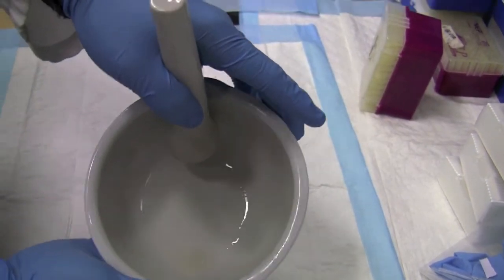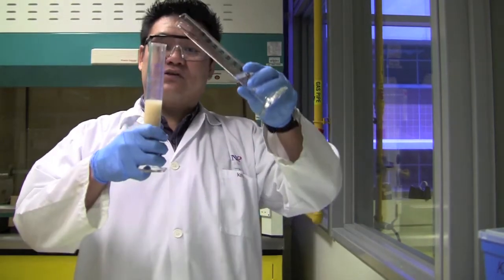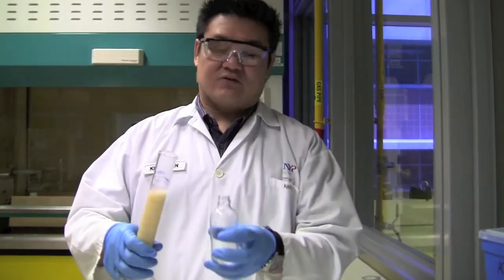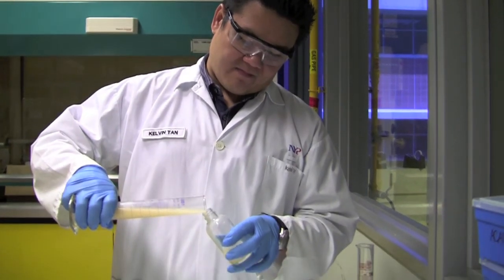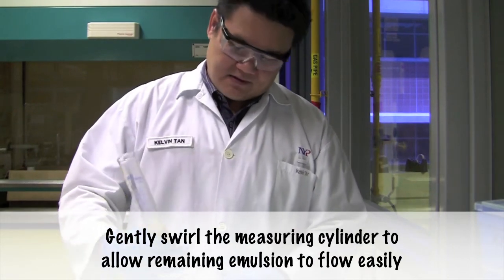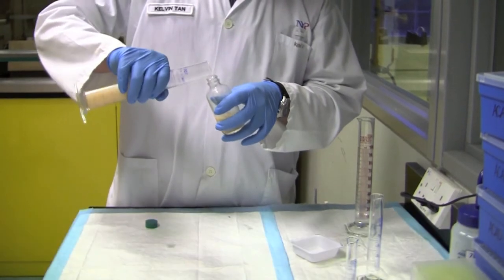After a few rounds of rinsing, this is what's left in my mortar. The final step is to top up the volume to 100 mls. I've got some peppermint water here. Transfer the emulsion into the bottle, and just towards the end, give it a good shake as well, to get everything inside the bottle.